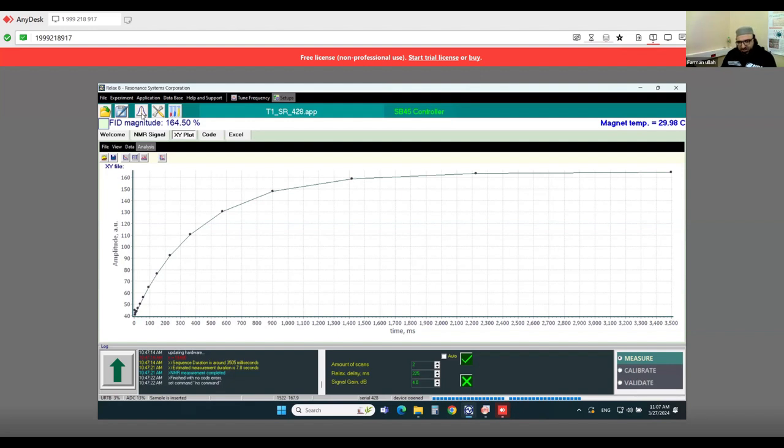The main difference between these two equipment, FFC and time domain, is that in FFC we only perform the longitudinal spin experiment, while in time domain we perform both experiments. So we need both types of pulse calibrations.